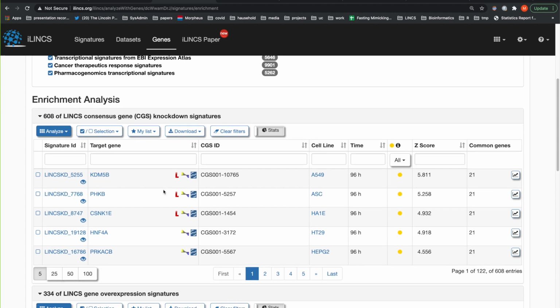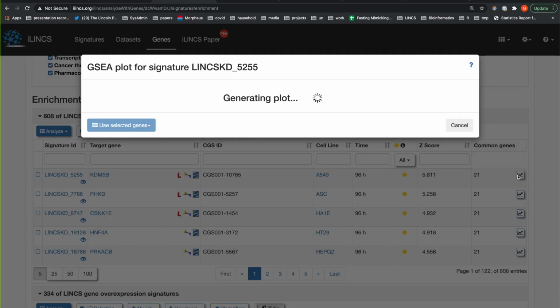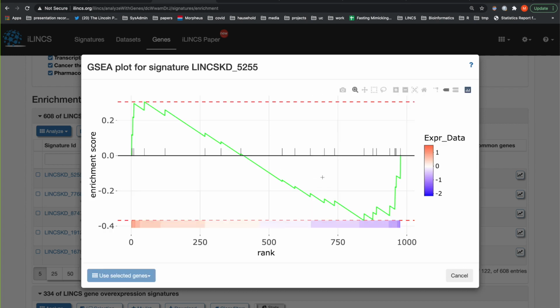So basically, for each concordance measure, previously there were little scatter plots when we correlated the full signatures. But each of these connections that are made, when a connectivity analysis is run, produces some kind of interactive plot that allows you to visualize why these signatures are connected.